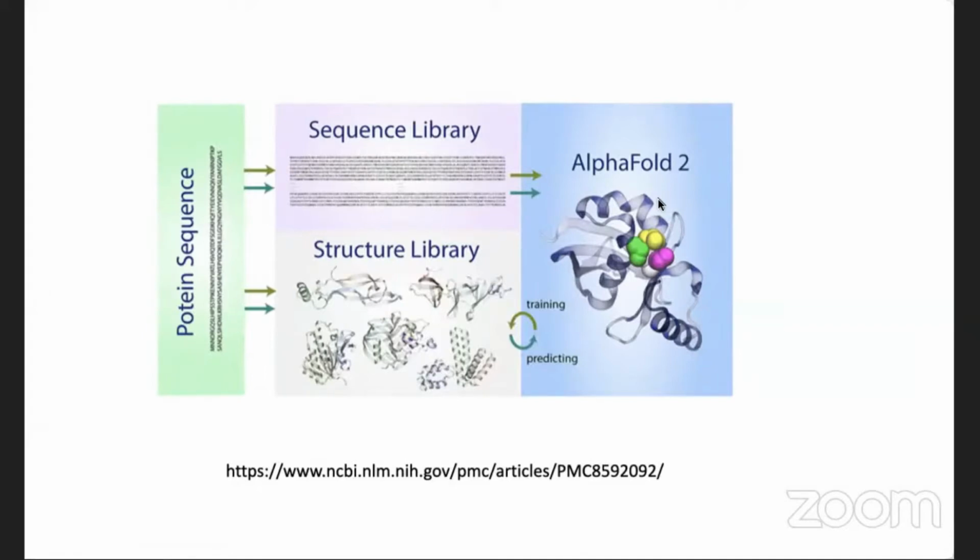Yes, Sarah. Hi, Sarah. Yeah, we can try with your sequence. There's just one limitation with sequences: for predicting larger sequences, the number of amino acids is directly proportional to the time the prediction is going to take. Usually the predictions run on GPU and CPU. Still, because a lot of people are using this, the prediction would take an hour and sometimes more. We will go through that entire process, and yes, Sarah, we will have that.